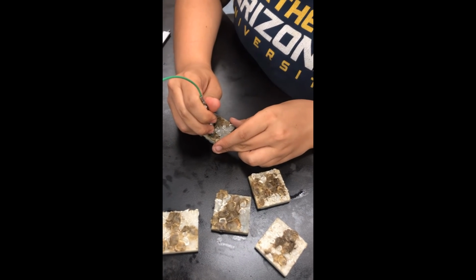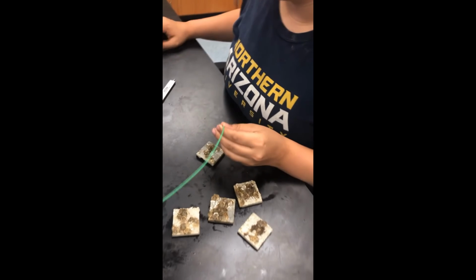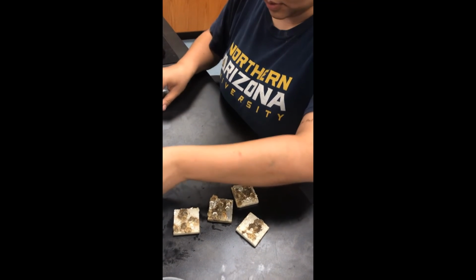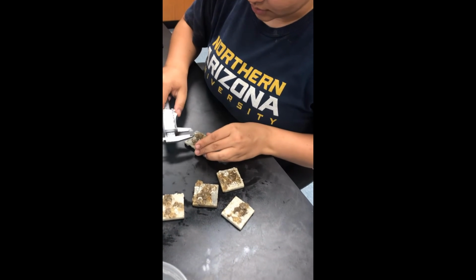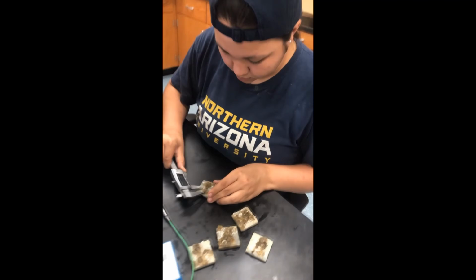You can see me applying gentle and consistent force to spat using a penetrometer, which will read out the raw crushing force in newtons, followed by measuring the length of spat shells in millimeters. The raw crushing force will be divided by the length to provide the standard crushing force in newtons per millimeter.